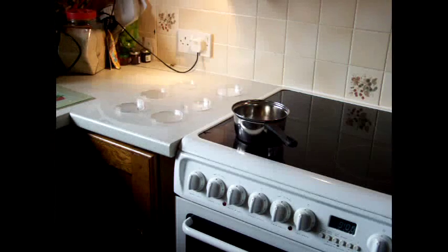Using the quantities that I am using will be enough to make about three agar nutrient plates. However, it's really easy to scale up or down depending on how many you want to make at once.